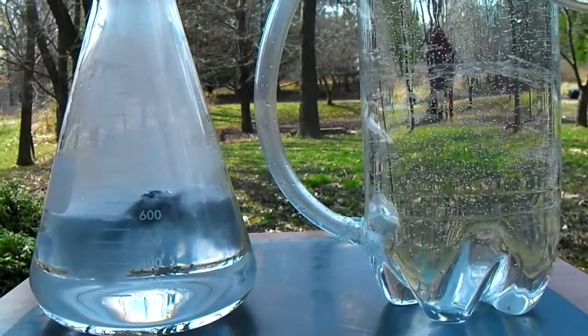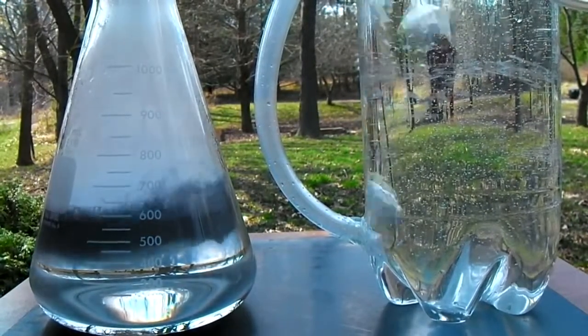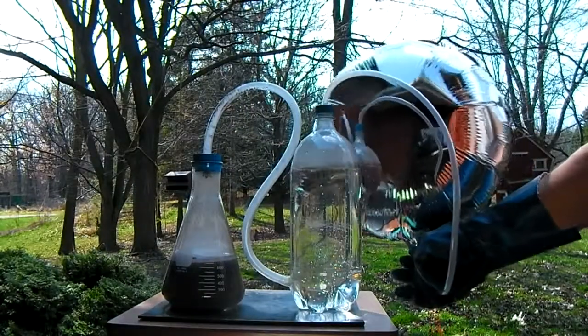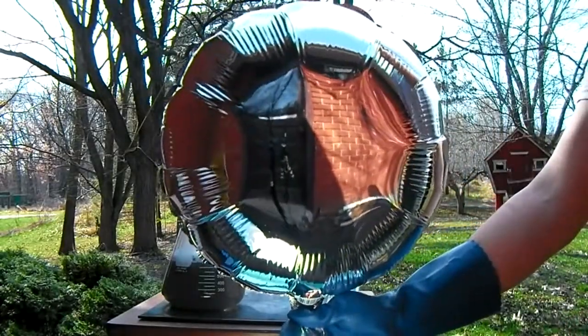Bubbling the hydrogen through water cleans the gas and removes impurities and acid vapor that would otherwise be present without this step. Once through the water, the clean hydrogen is then fed into the quarter inch vinyl tubing and from there can be filled into balloons or any other container it is to be held in.